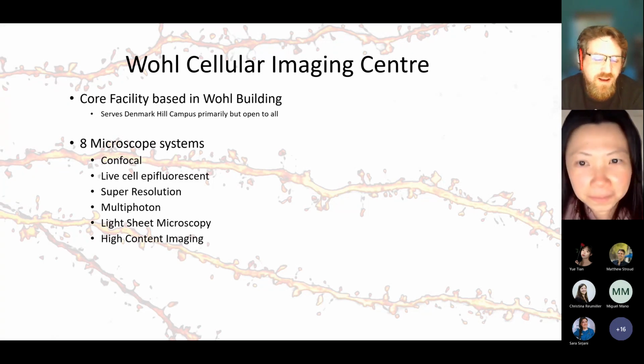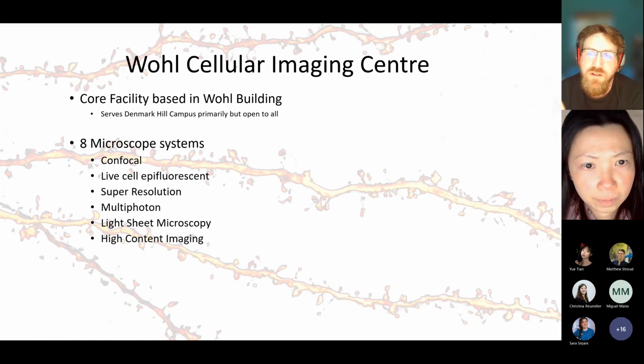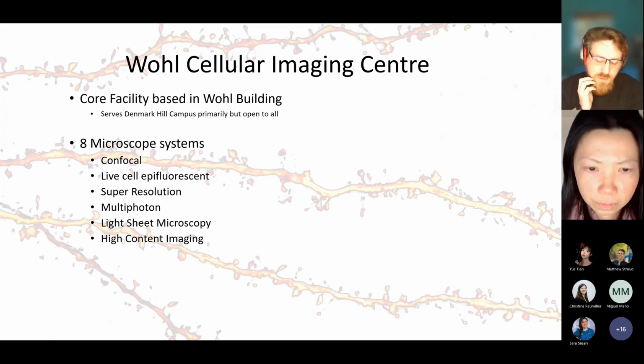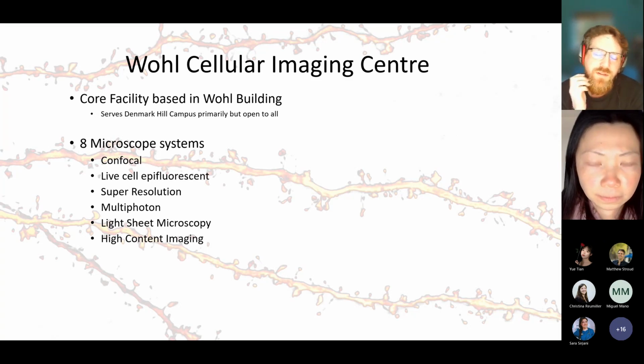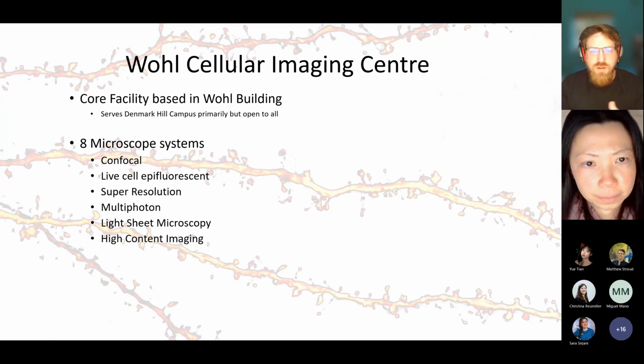There is more to it. At the nanoscale, you have to actually be a bit more careful about what kind of fixative you use. As it turns out, the standard fixation only fixes about 40% of your proteins in place. And ideally you want to try and retain all of them. So there are some alternatives, such as glyoxal, or a mixture of that and some other compounds. So that's one stage where you need to look at trying a few things.